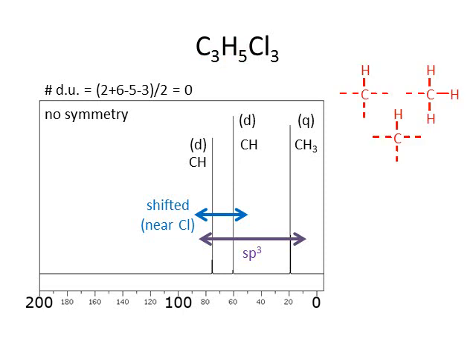So let's draw those pieces out. But that's not all my pieces. I'm still missing the chlorine, so let's take those out. So let's start putting things together. I could just start from here, and that would be a pretty easy way to do it, because there's not that many.